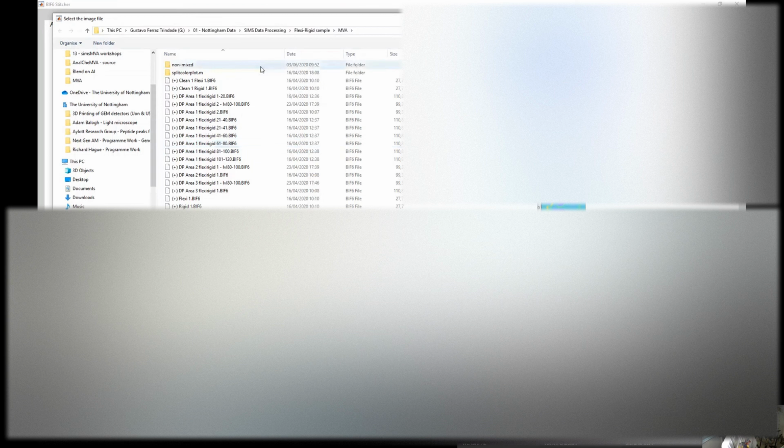In terms of the experiments, what I noticed is if you want to get the pure homogeneous stuff, it's sometimes good to do it before and after cleaning with the argon, with GCIB. So you end up with 4 references. Here I'm only adding the cleaned version, but sometimes it's worth doing it before and after cleaning because you don't know how clean the surfaces are.